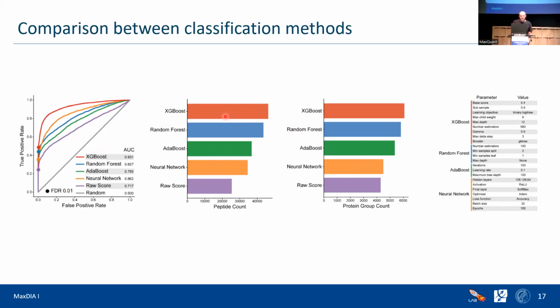And you could still change the hyperparameters of it. But we have some default values, and as we heard several times now, usually our default values are good. So you're usually not expected to change these. And it's actually also good that these are not tuned on every dataset from you.